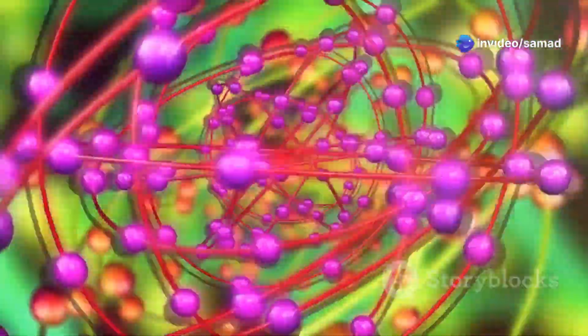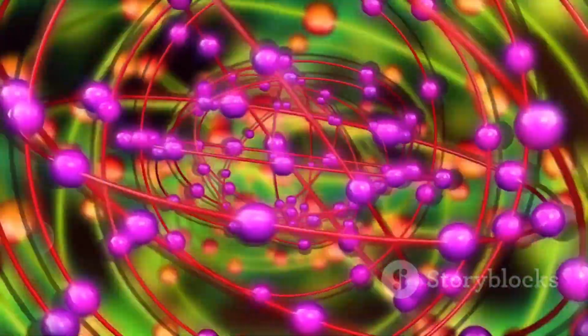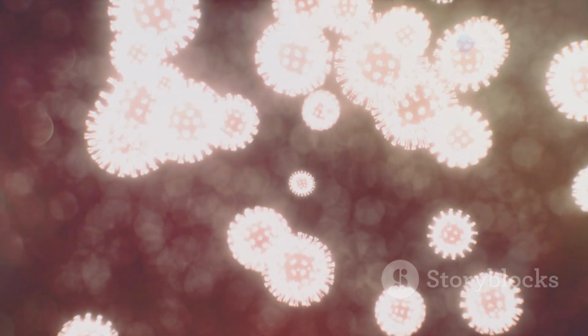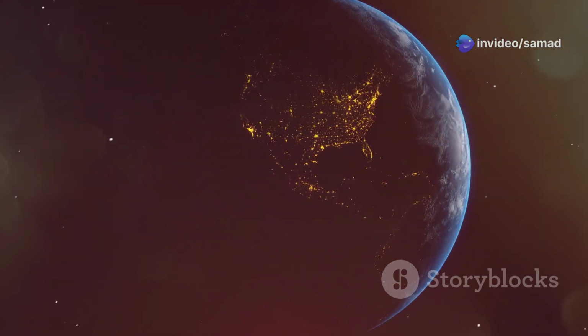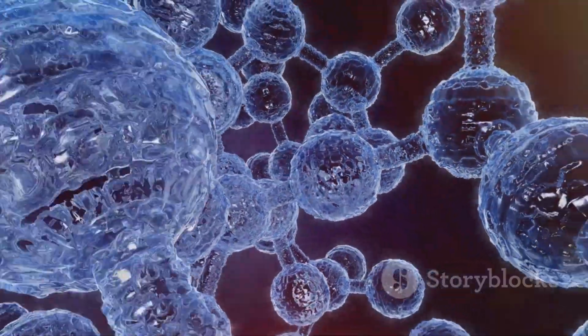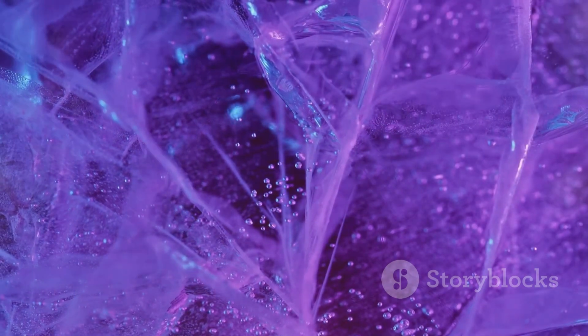Electrons, despite their particle-like behavior, also exhibit wave-like properties, but with a much shorter wavelength than visible light. This shorter wavelength allows electron microscopes to achieve resolutions down to a fraction of a nanometer, revealing a world of detail previously invisible to us. This remarkable leap in resolution is akin to discovering a new continent on Earth. It has opened our eyes to the intricate structures and processes that govern the natural world at the nanoscale. From the delicate arrangement of atoms in a crystal to the complex machinery within a single cell, electron microscopes have unveiled a universe of wonder hidden within the ordinary.